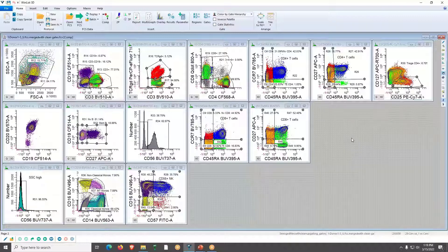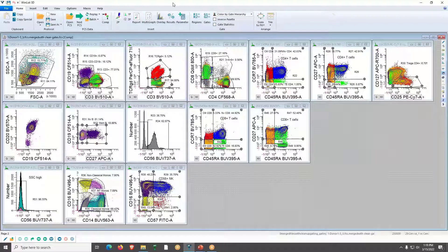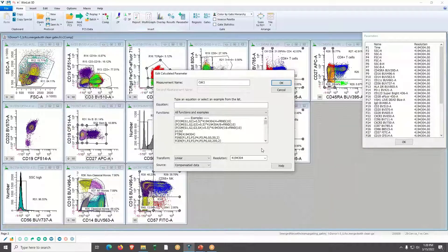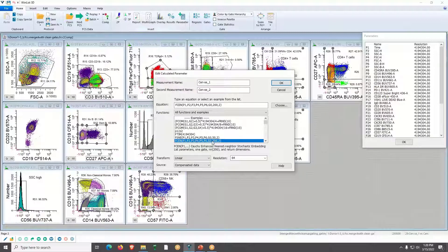Next, I'm going to create a Cen-se'. In WinList, Cen-se' is created as a calculated parameter. I'll click the Calculated/Add Parameter tool and get an empty window since we don't have any yet. I'll add one, which brings up the Edit Calculated Parameter box. All you have to do is choose the example you want to use — I'll click FCEN.